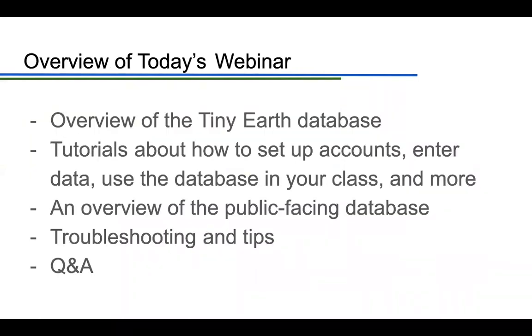An overview of today: this webinar is designed mostly for our new and early users. We're going to give an overview of the Tiny Earth database, with tutorials on how to set up accounts, enter data, use the database in your classroom, and more. Then a quick overview of the public side, ending with some troubleshooting and tips. We'll leave about 20 minutes for questions and answers at the end, so please post your questions to the group chat.